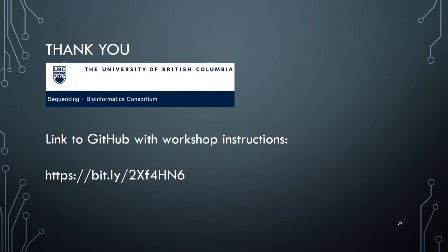But for Nanopore, do we need to connect the tools to Snakemake, or download them into the Snakemake pipeline? Yeah, you can write your own pipelines. There are some pre-made ones out there that you can check online. I can't remember what the website was exactly, and I'm not sure if anybody has any for Nanopore yet, but I'm sure someone has written some somewhere. It should definitely be able to be written easily. Okay.